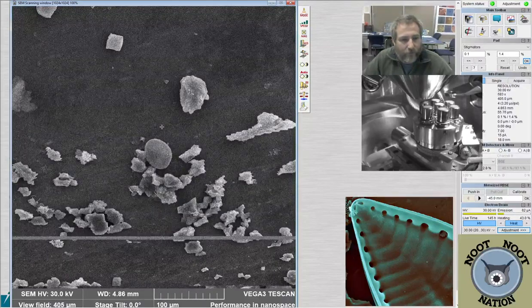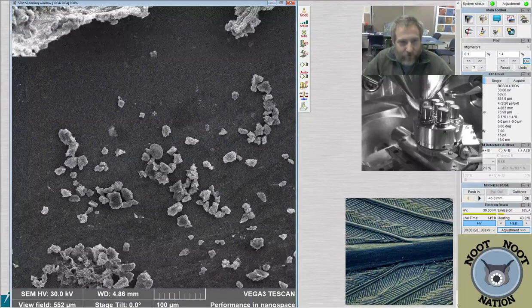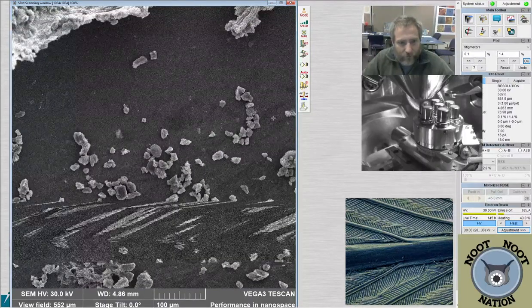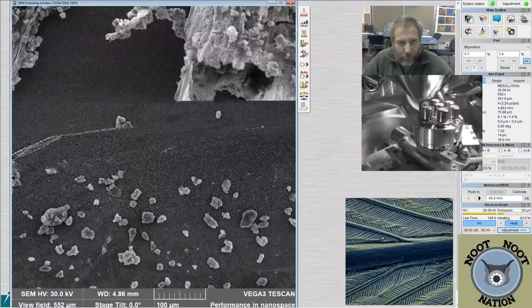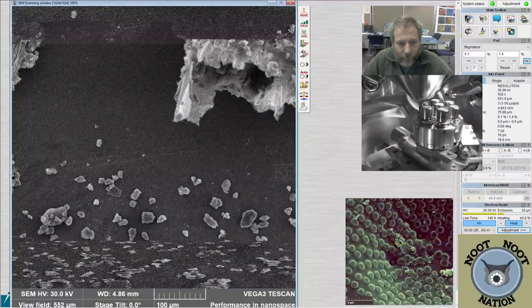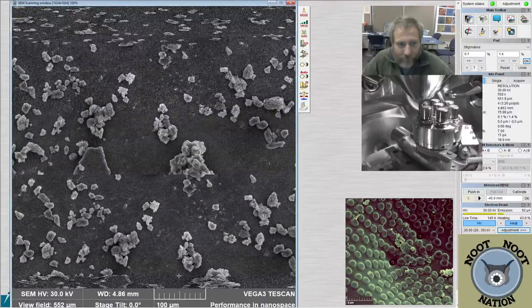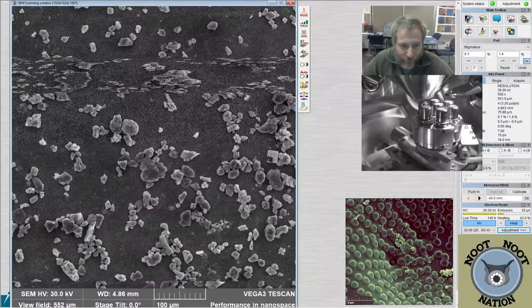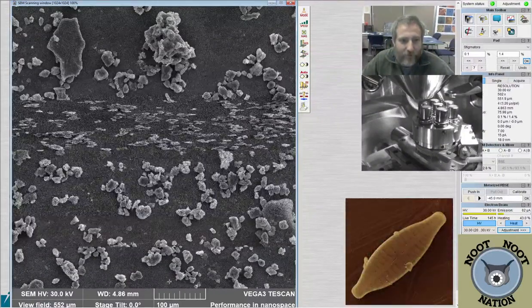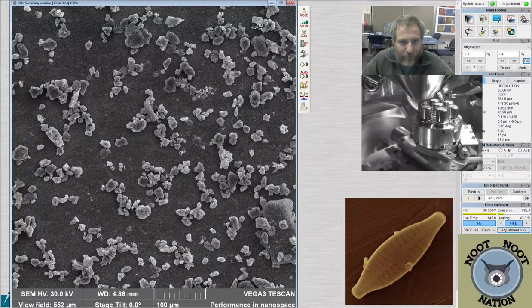And the surface is kind of covered with junk, so I can't really see exactly what's going on there. Can do a bit of just basic, well, it has these things, so it should be this. So it's not a whole lot of elliptical shaped diatoms. Egg shaped diatoms are pretty uncommon, so.